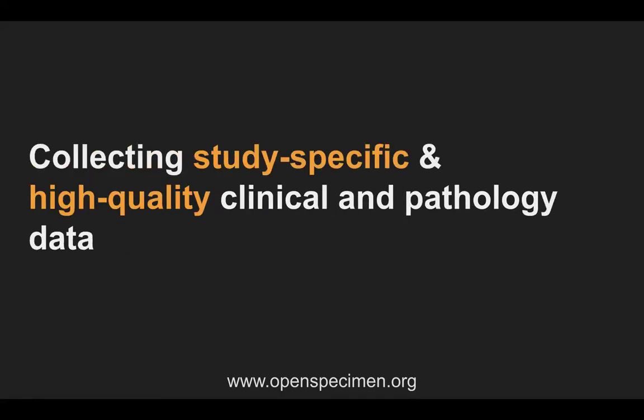The other challenge is that every study, every institute, every group might have different data collection needs. For example, if you're collecting specimens for a COVID study versus a cancer study versus a diabetes study, what data you want to collect, either clinical data or pathology data, test results, etc., would be different based on each one of these. Again, you need the ability to modify or configure the system per study based on these kinds of requirements, and add to it the ability to report.